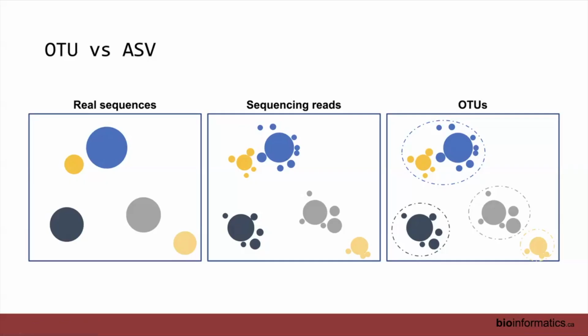You might imagine that when we're sequencing and we're introducing these errors, we're ending up with all of these different options, even though this one, looking at this blue one, might be what the sequence was actually supposed to be. And so if we're looking at OTUs and we just cluster at a certain percent similarity, we might be losing some of the information between these two things that actually were different from one another, although they may fall within our 97 or 99% threshold, whatever it is that we set.